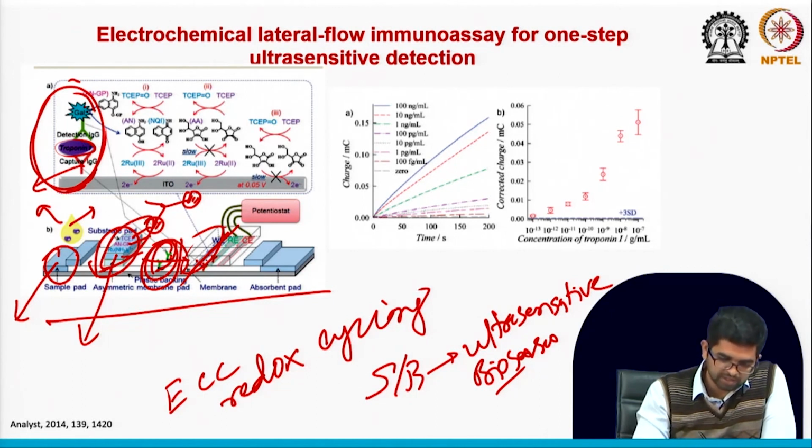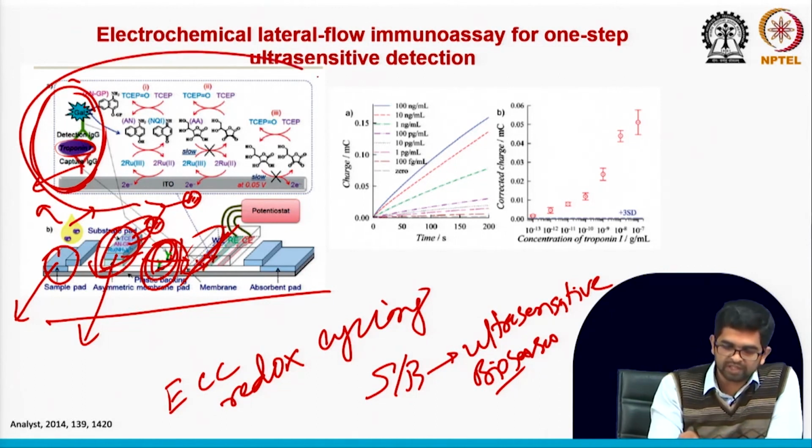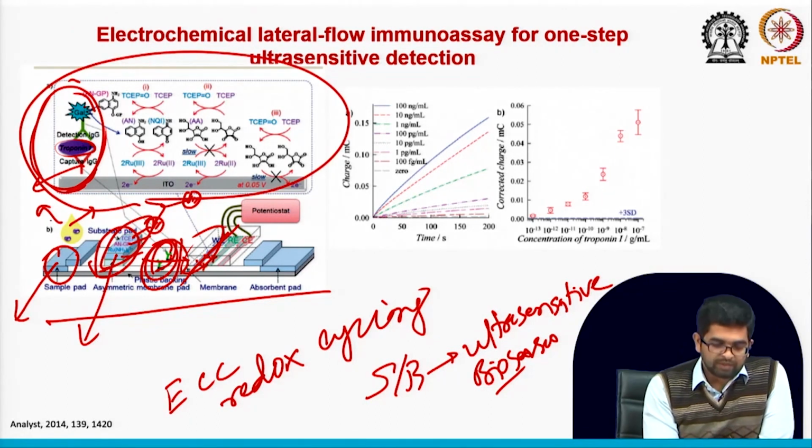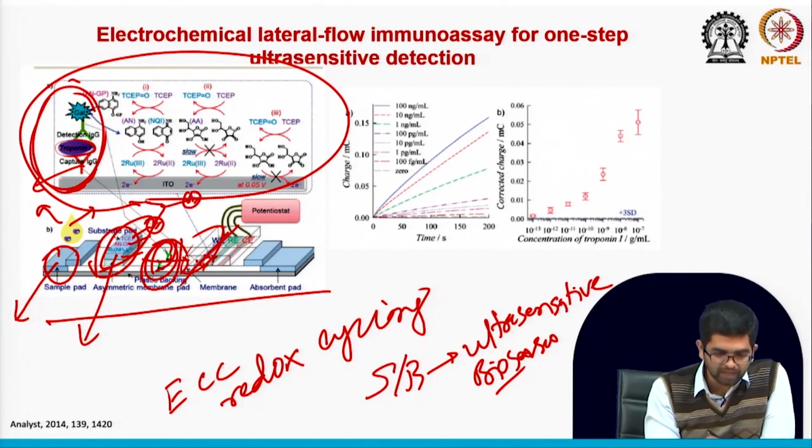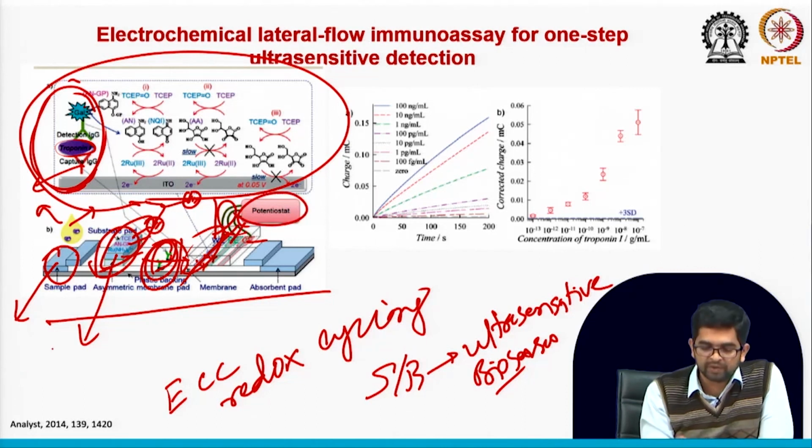So this will form on the working electrode. In this working electrode area, I am showing it in this broad view, and here highlighted we zoom in and show all the reaction parts on the working electrode. After this, see here you have the working electrode, reference electrode, counter electrode. We can connect this with the potentiostat. We can make a portable small potentiostat that we can connect.